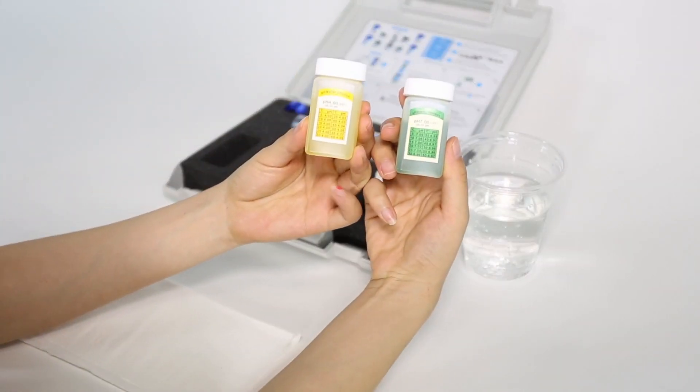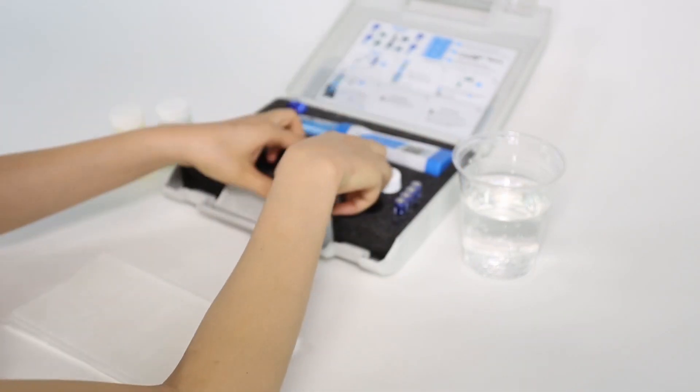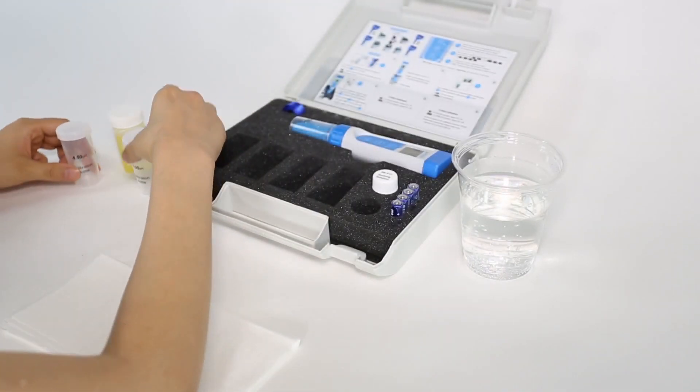Pour some pH 7.00 and 4.00 calibration solutions to about half of the accordant calibration bottles. Replace the calibration solutions once they become contaminated.